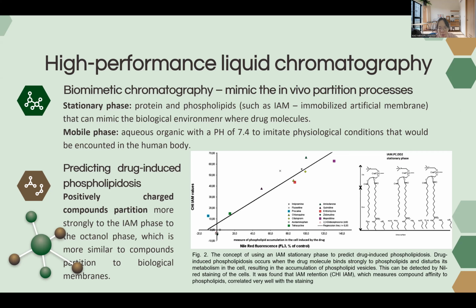Although the IAM retention selectivity and the derived binding data show similarity to octanol-water partition, they found that positively charged compounds partition more strongly to the IAM phase than to the octanol phase, which is more similar to compound partition to biological membranes.